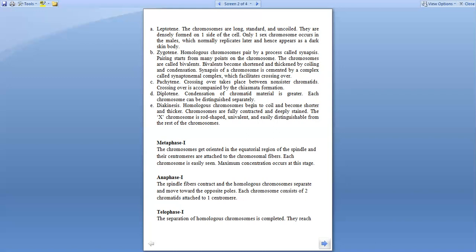Diplotene is the condensation of chromatin material and here the chromosomes can be distinguished separately. In diakinesis, the homologous chromosomes become more coiled, shorter, and thicker. The chromosomes are fully contracted and deeply stained. The X chromosome is not paired; it's univalent and now easily distinguishable from the rest of the chromosomes.